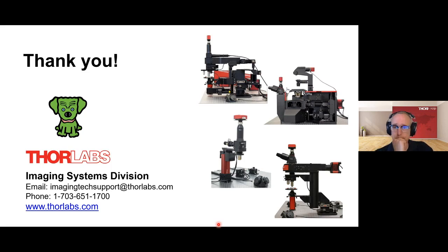Okay. Now, the follow-up on pinholes is that optical sectioning depends on excitation pinhole size, right? Emission. There are a few questions about excitation and emission. Is it necessary to have two pinholes in confocal microscopy, or is just one pinhole in front of the detector enough?